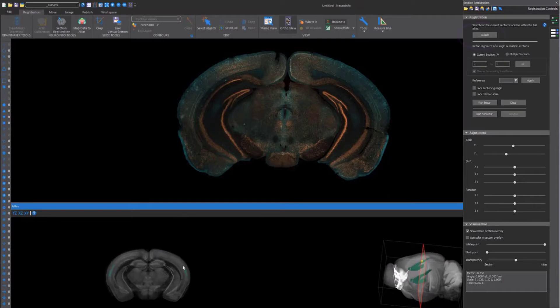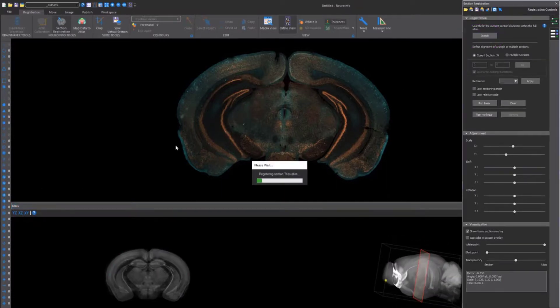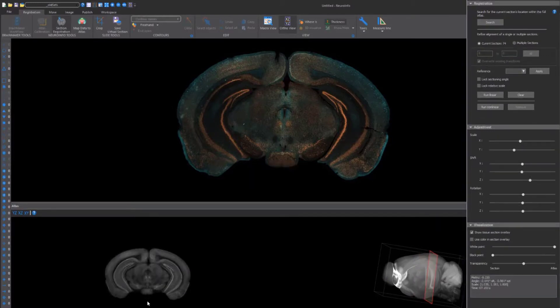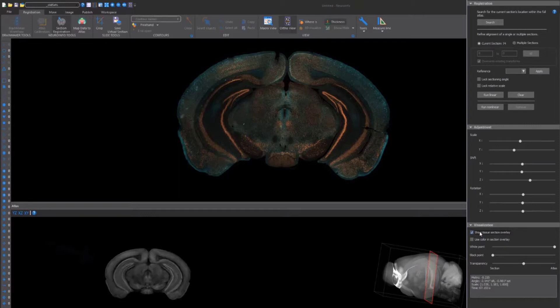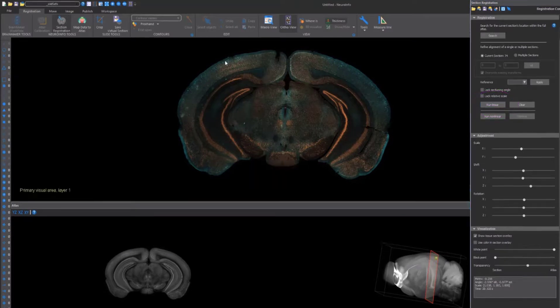While in the Registration section, click Search. Neuroinfo then searches the atlas for the atlas section that best matches to the image that you chose. Once it's finished, you can overlay the atlas on top of your image to see how well the fit is. If it hasn't matched well enough, then Run Linear to have Neuroinfo refine that fit even more.